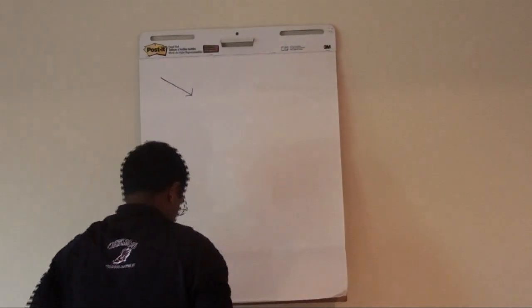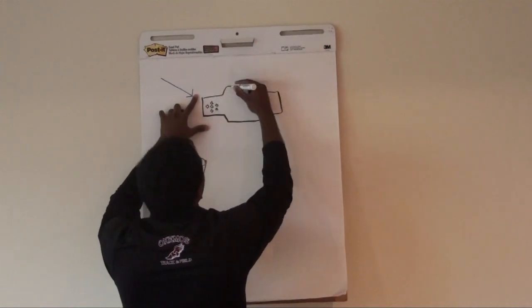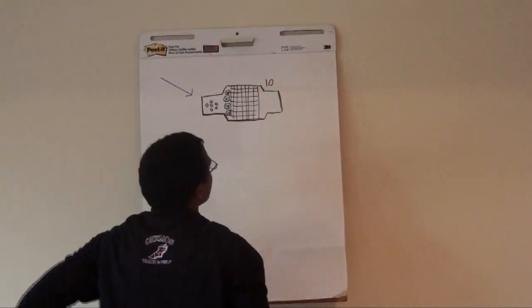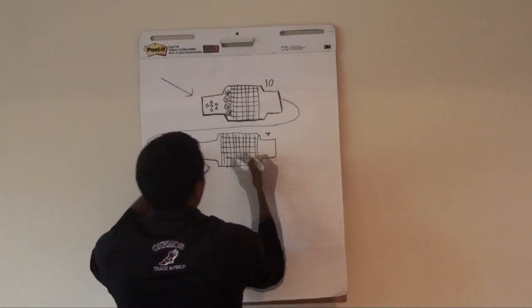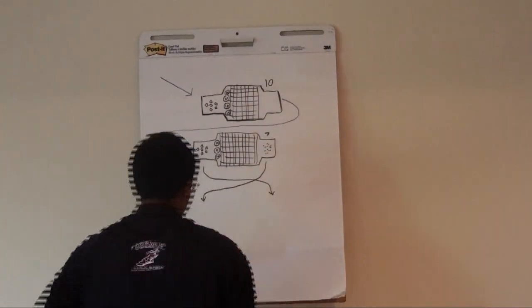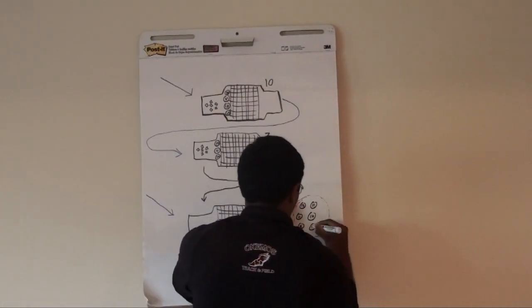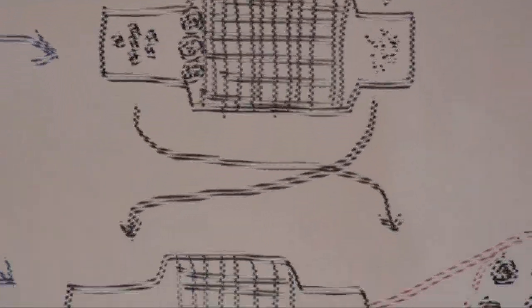The next step of this experiment is to see if we can use these same microfluidic devices to isolate a narrow distribution of size. The setup would be to run droplets through the 10 micron filter and weed out the large droplets. Then we'd use the 7 micron filter to let the small ones pass through, then reverse the flow on the 7 filter to collect the occluded droplets on the inlet side. This would hopefully lead to a distribution of droplets approximately between 12 and 9 microns. I've gone through the first steps, now I just need to make sense of the data.